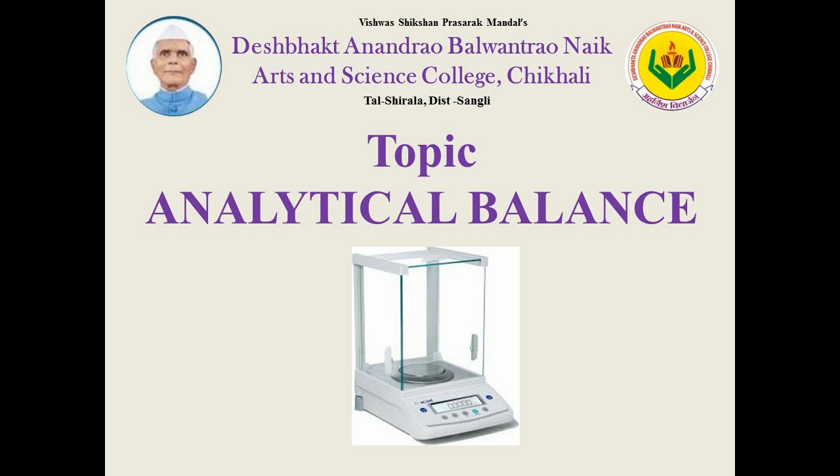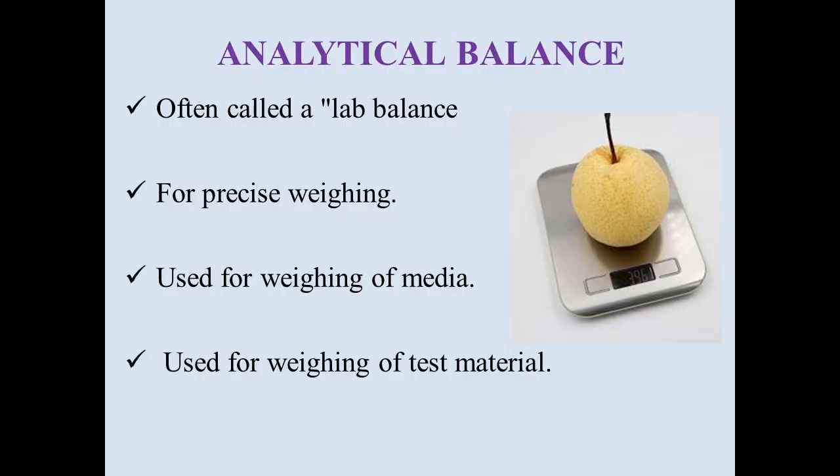The most widely used type of analytical balances are balances with a capacity of 100 grams and a sensitivity of 0.1 milligrams. Analytical balances are often called a lab balance. In a microbiology laboratory, it is used for weighing of culture media and weighing of test material.